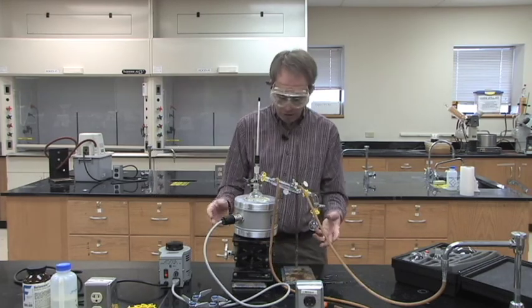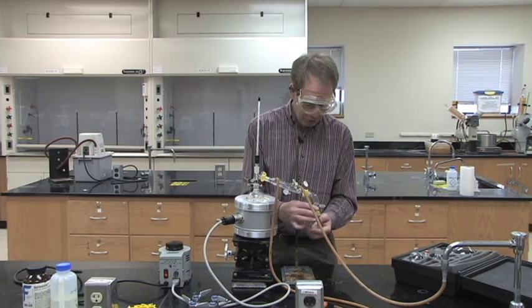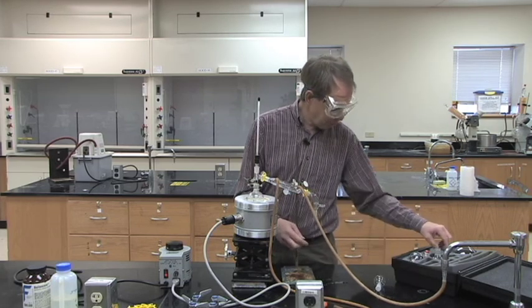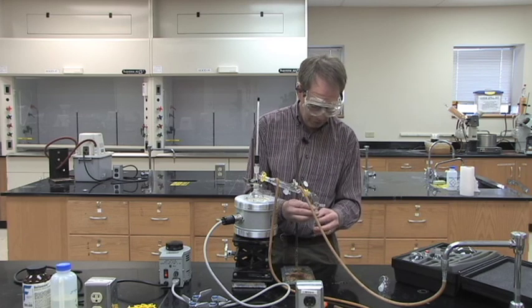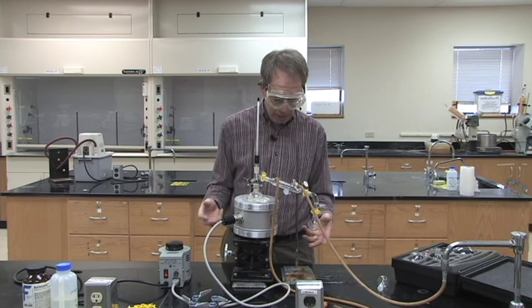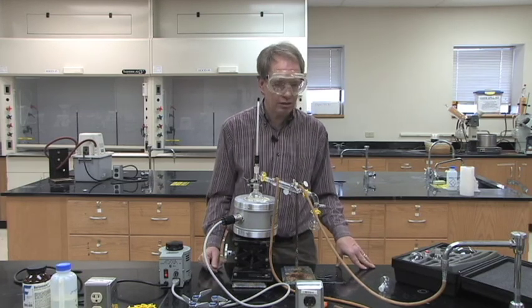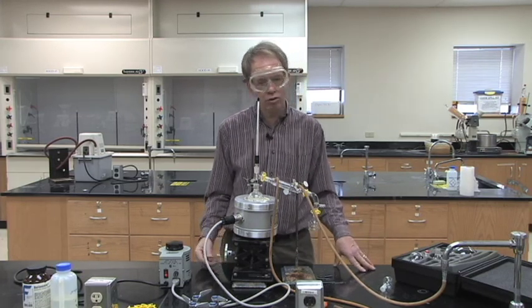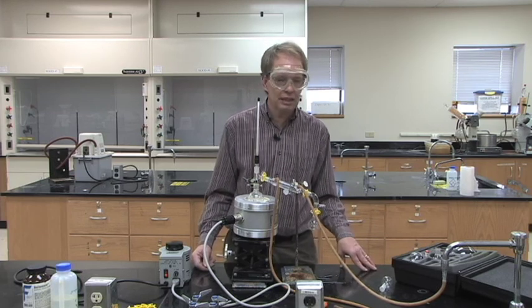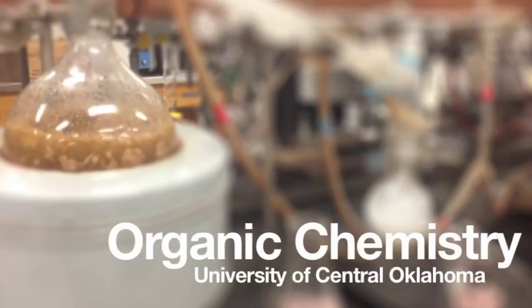And then once you get it to distill, the first couple of drops that distills, you can take away and dispose of and then put another flask up here to collect the rest of your sample so that the forerun you get rid of and then anything that distills from that point on you're ready to use to keep for doing your refractive index to identify what your unknown is in lab and then you're ready to use.